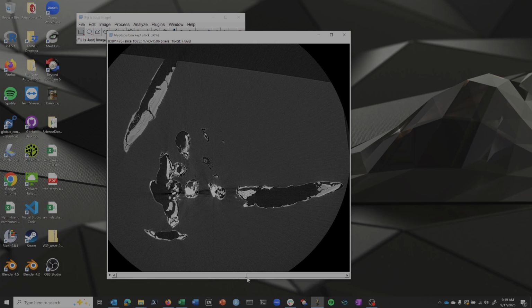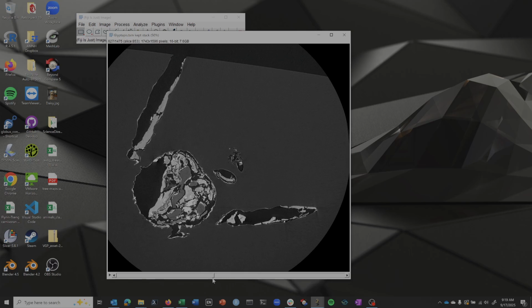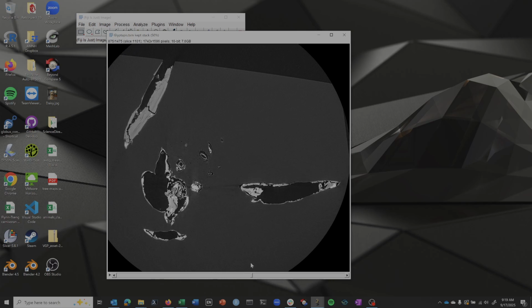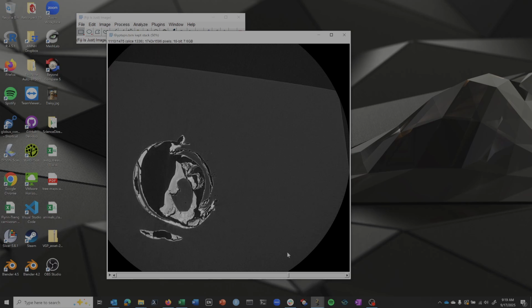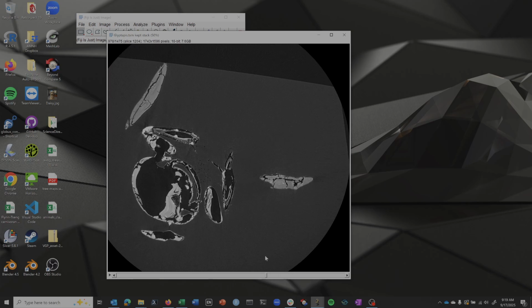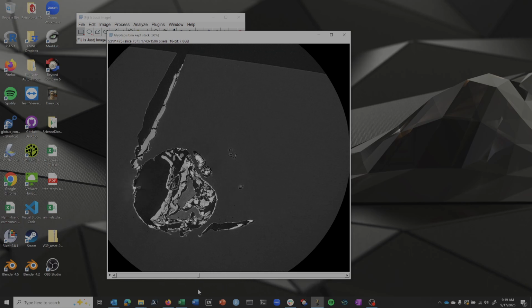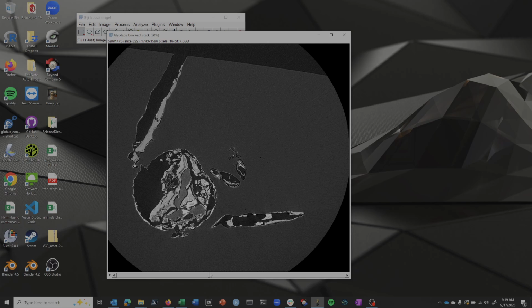Now the reason this is important is because loading and saving files can take a long time, in particular loading, because really you only save it once after you do something like this, and the volume file doesn't typically change. But your segmentation files are often the same size as the volume. They have to be because it is a representation of the volume with tagged voxels in there. That's how segmentation works. So the smaller your volume file is, the faster your workflow is.